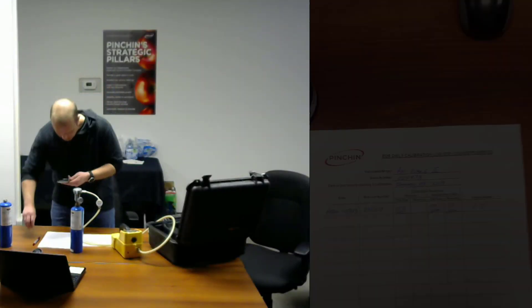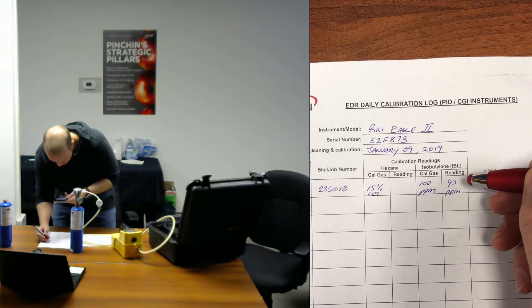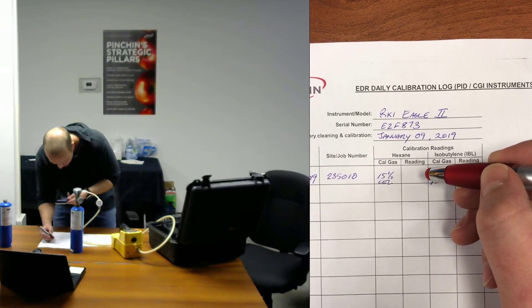Now I'm going to record all my information to my field form. You can see here that I already recorded my 93 parts per million for the isobutylene reading, and now I'm going to record my 15% LEL for my hexane.